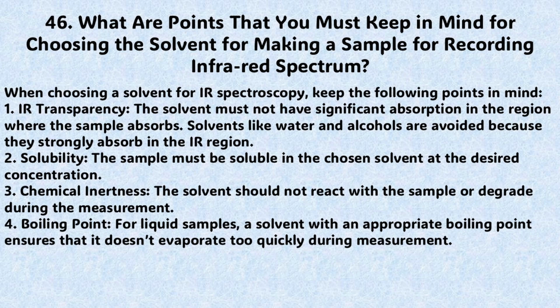The next question is question number 46. What are the points that you must keep in mind for choosing the solvent for making a sample for recording the infrared spectrum? The answer to this question is very simple. When choosing a solvent for infrared spectroscopy, keep the following points in mind. Infrared transparency: the solvent must not have significant absorption in the region where the sample absorbs. Solvents like water and alcohols are avoided because they strongly absorb in the infrared region.